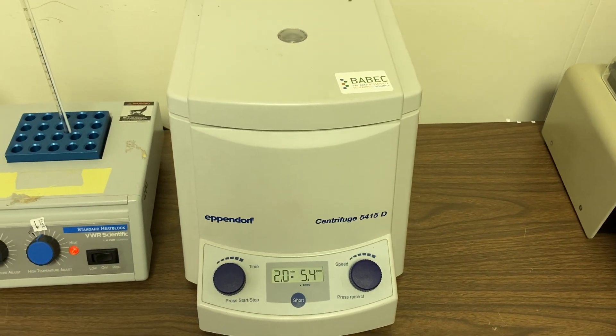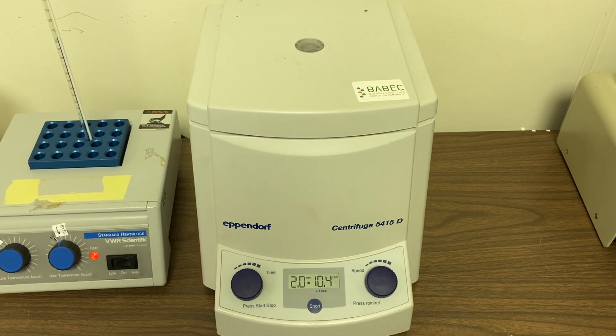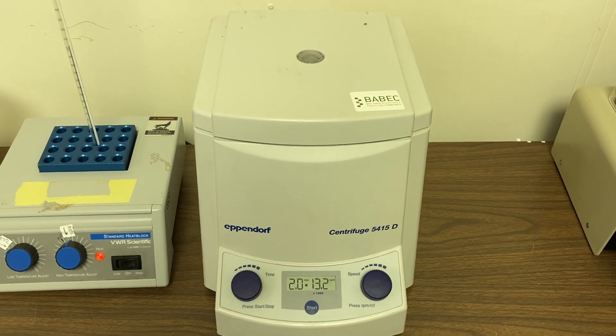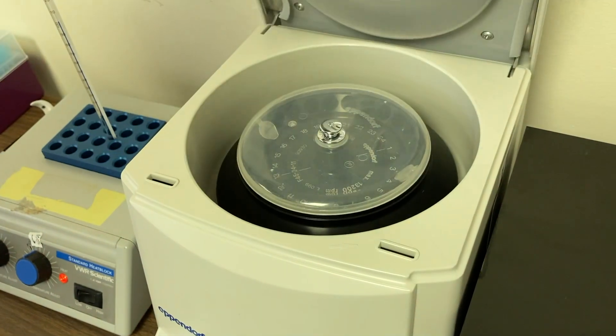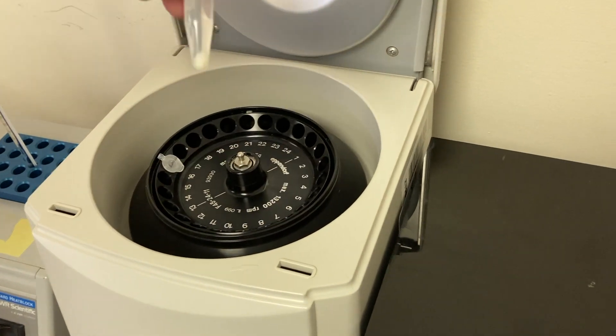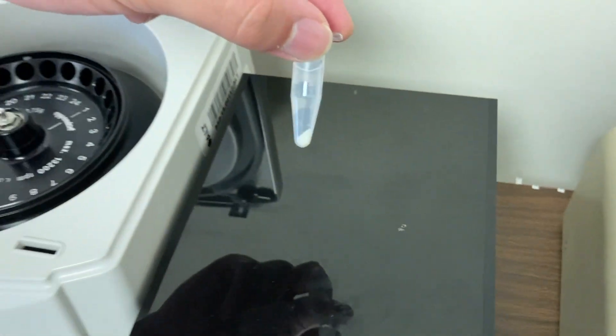Inside, those cells are starting to spin at a very high rate. Here's what it sounds like at top speed. Once your centrifuge has stopped spinning, remove the lid and take out your cheek cells. You'll see they're in a pellet at the bottom of the tube now — they're packed in there real tight.